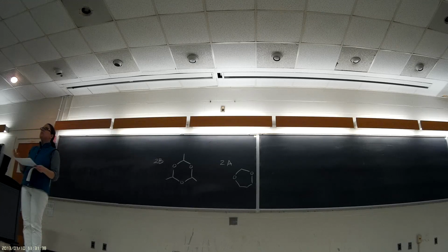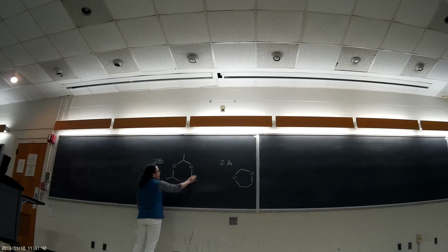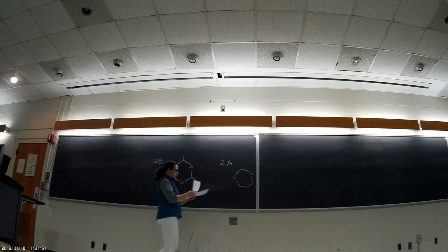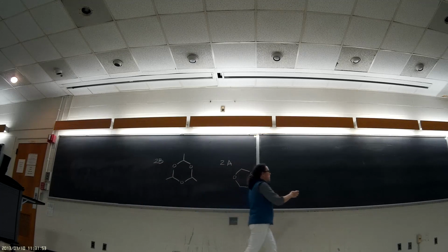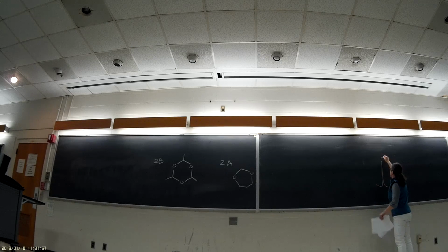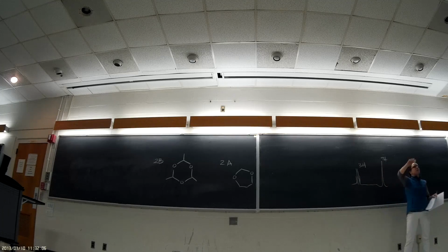I can't have a 2-part symmetry, though, because with a 2-part symmetry, I wouldn't have a peak that would have 9 hydrogens. So it had to be a 3-part symmetry. Does everyone know what I mean about that? There was 1 peak on here that had 9 hydrogens. If you looked at the NMR for that B, you had 1 that had 9 hydrogens. This actually was a doublet, but it's very hard to see. And then there was a quartet, which I've spread out a little bit. This one was a little bit easier to see, because you can see the differences in heights.